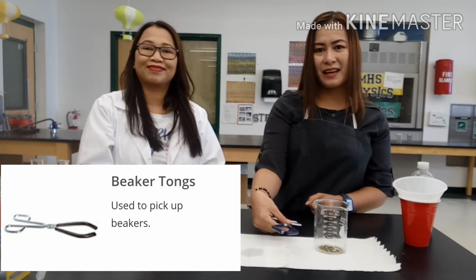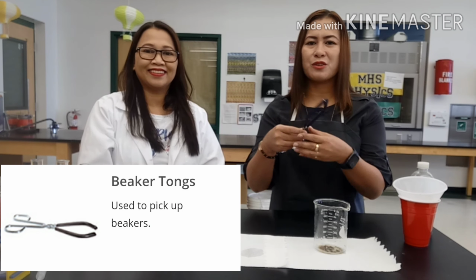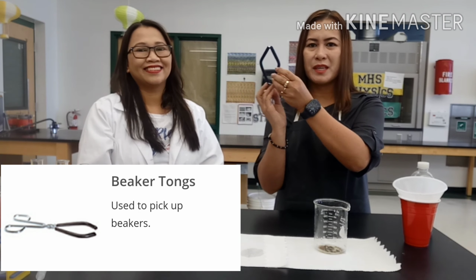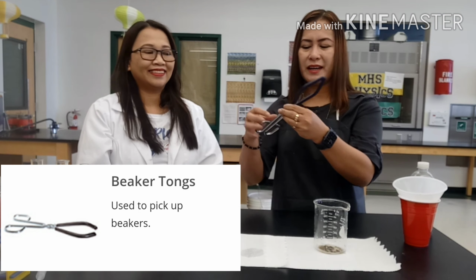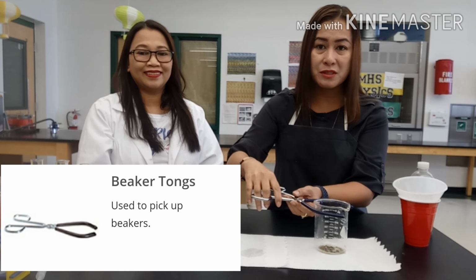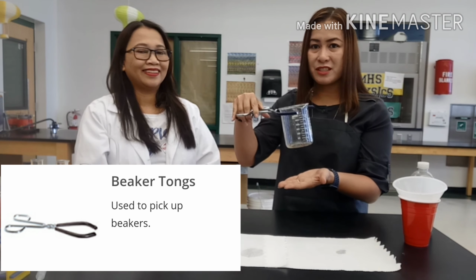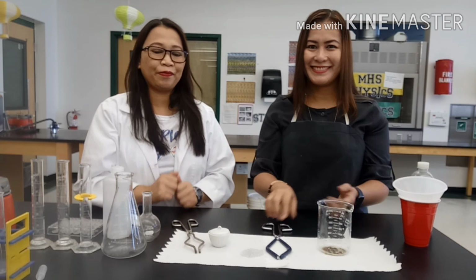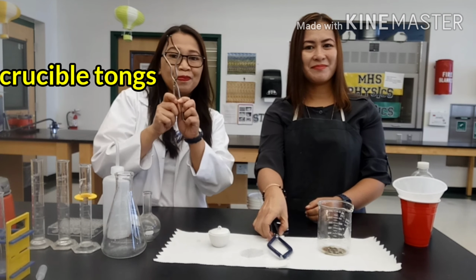The other one we have here is your beaker tong. As you can see, the difference between the other one and this one is that it has a bigger clip on the top. This one is used, as the name itself says, to hold your beaker in an upright position. So this is your beaker tong. All right, now you know the difference between a crucible tong and a beaker tong.